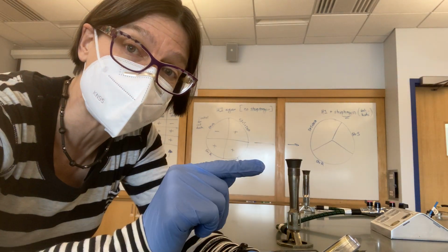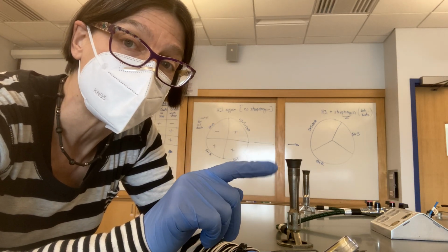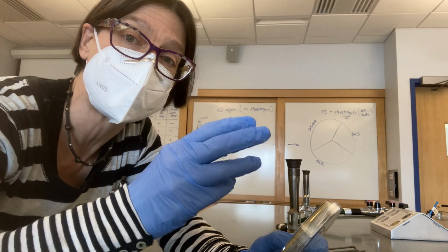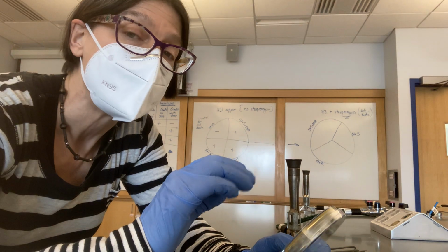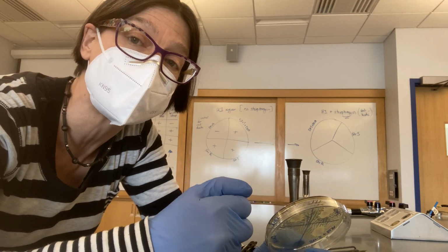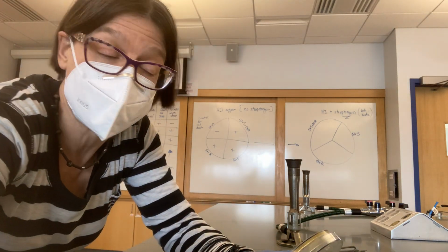And so we took that DNA and we mixed it with cells of STRS, which lacked the AAD2 gene. And hopefully what happened in that little mixture is those STRS cells took up DNA from the environment, including the AAD2 DNA, and then incorporated that into their own genome, gaining that gene, and therefore gaining the phenotype of streptomycin resistance. And so what you would expect to see is what I saw on my experimental plate.